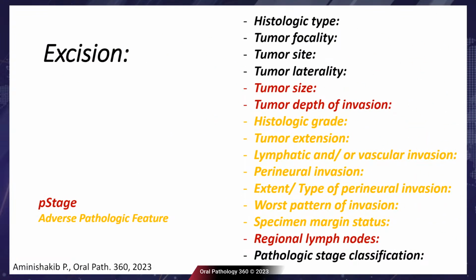If you have an excisional biopsy, I recommend you include all the criteria that CAP mentioned in the template, including histologic type, tumor focality, tumor site, tumor laterality, and you must also report tumor size, tumor depth of invasion, and regional lymph node involvement, because pathologists, and especially clinicians and oncologists, must determine the pathologic stage of the tumor.